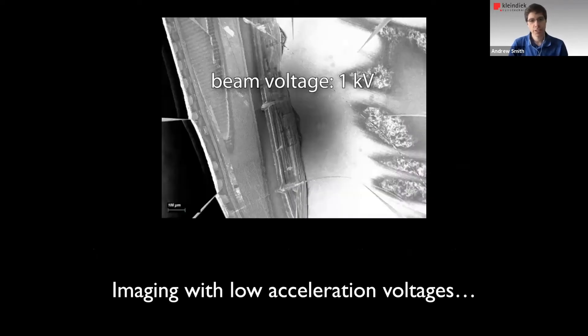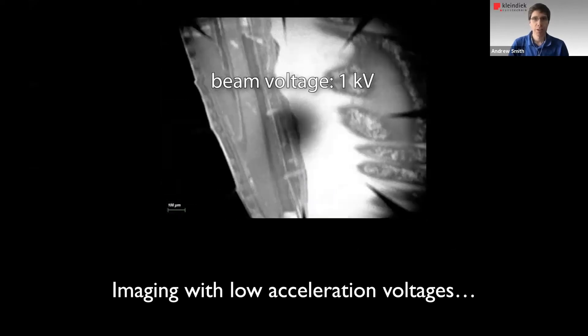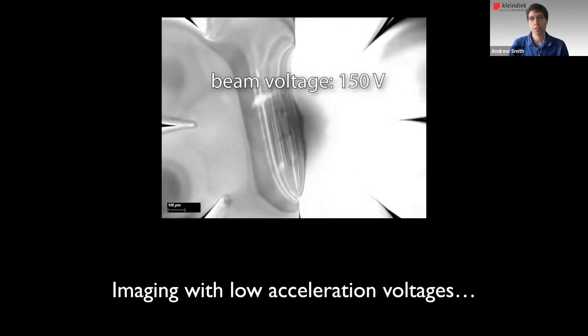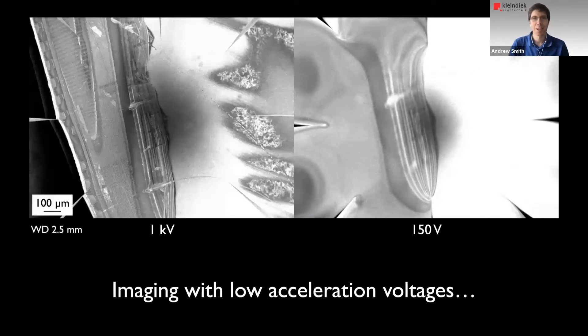Just touching on acceleration voltage one more time, this is a comparison between a 1 kV image, which you just saw there, and then switching to 150 volts. And you can see the image just goes to mush. So that just gives you a really plastic example of the challenge in getting good imaging at low-kV voltages.